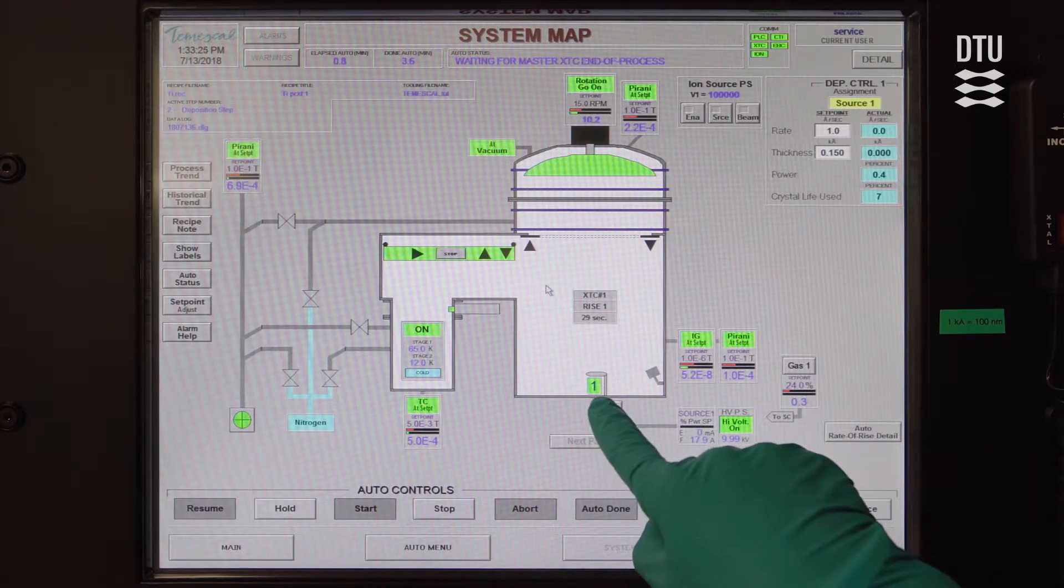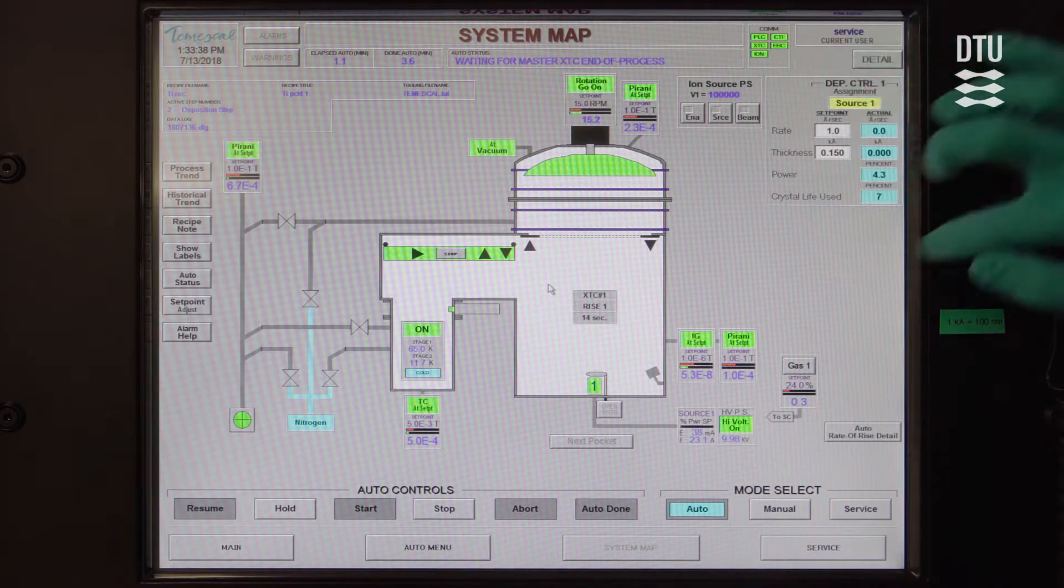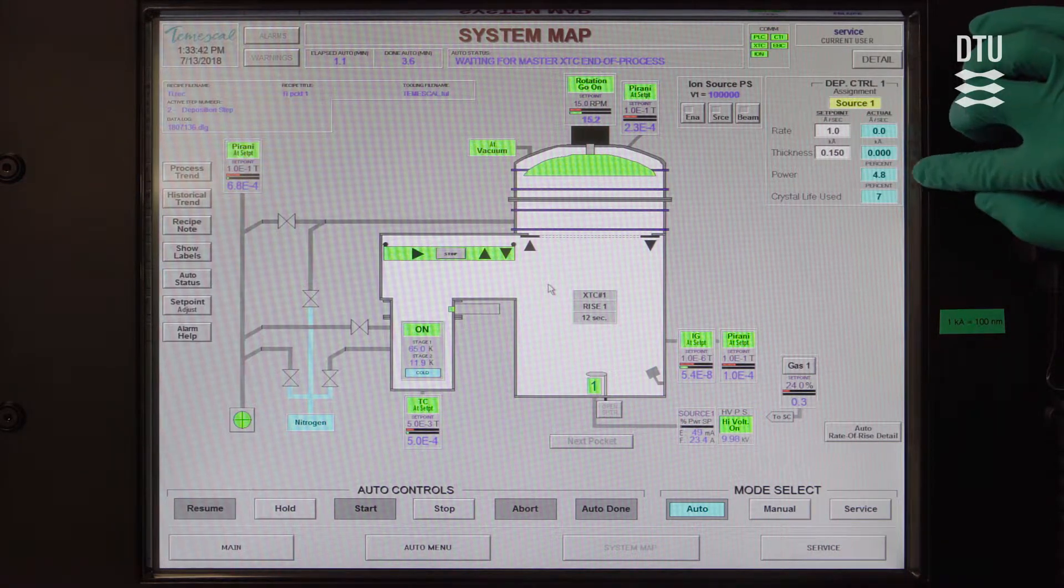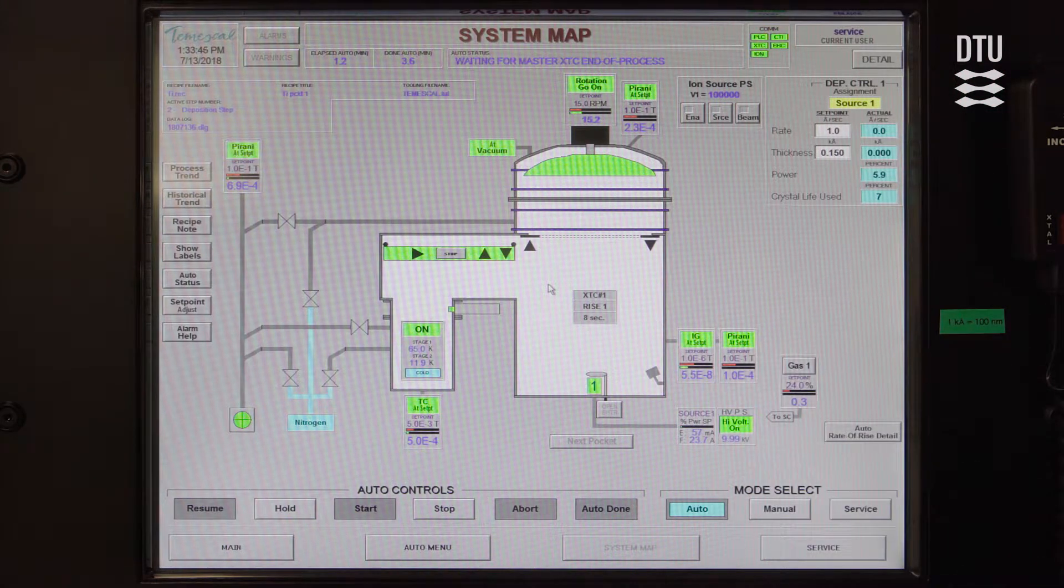And we can see that the source is active. And we are already now starting to put some power on the source. And you can see over in this part of the system map, you can follow what is going on and you can see the power that is being applied. And you can also see that we are in what is called rise one of the process.